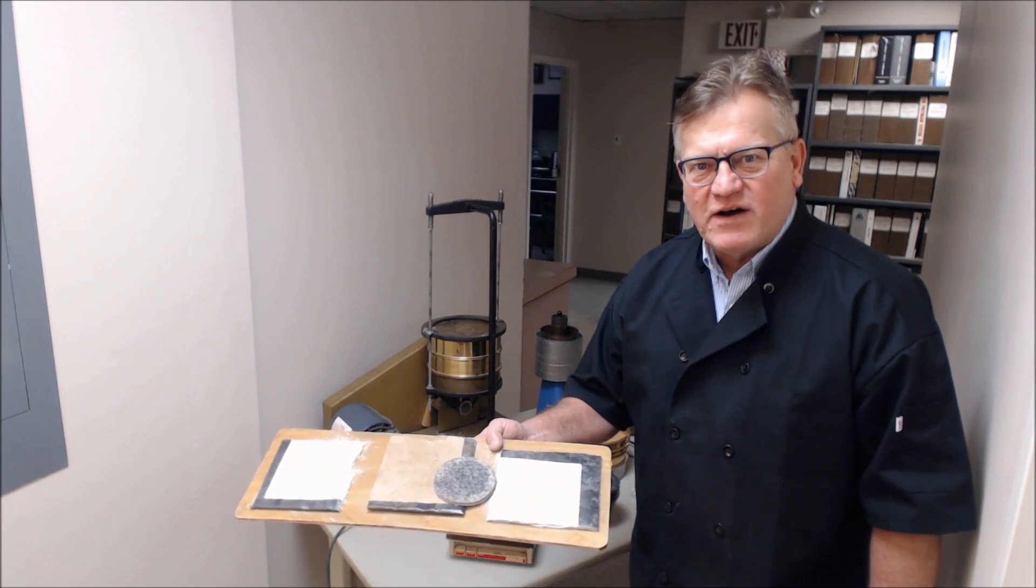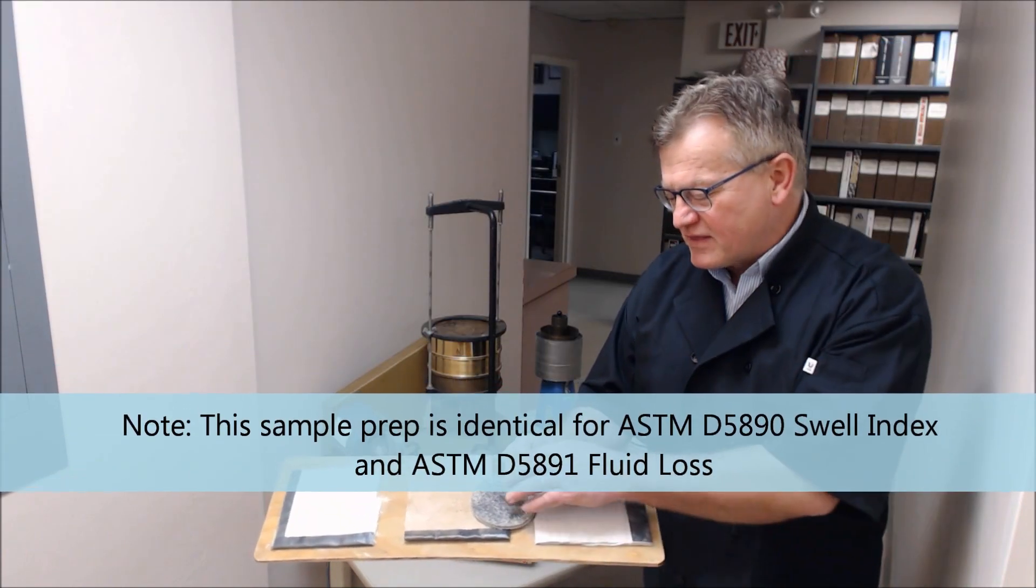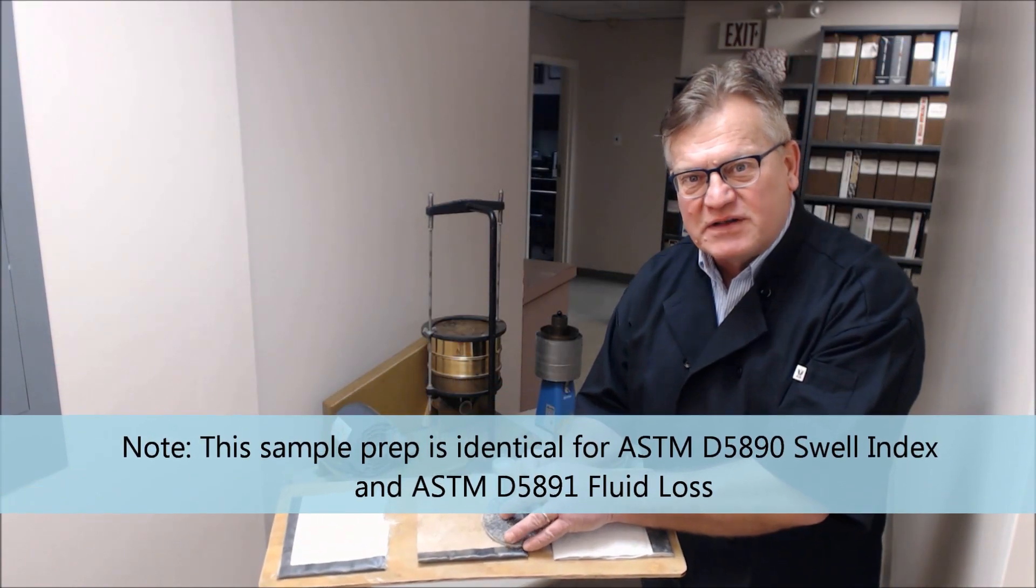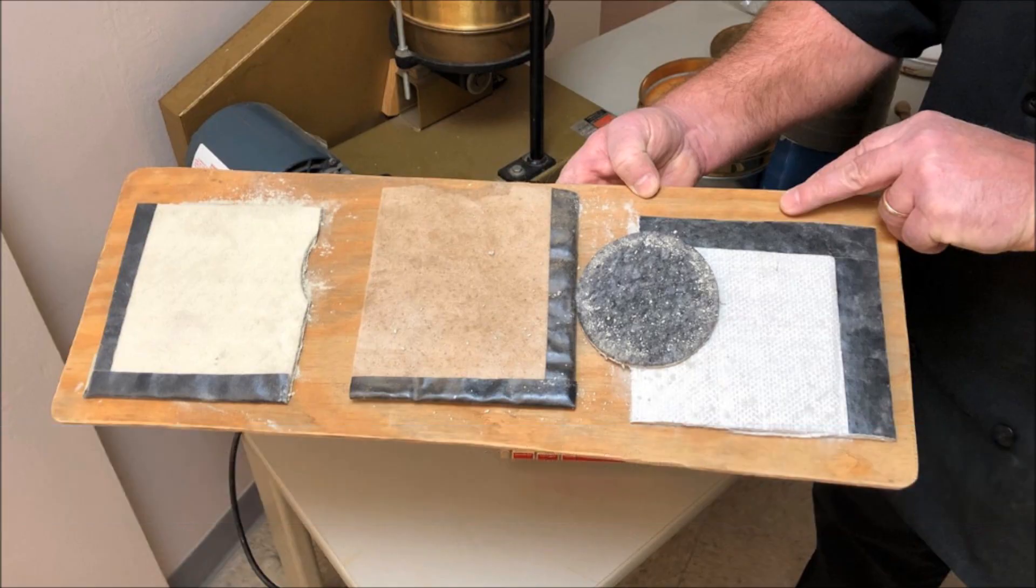Good morning, we're here at GSI to talk about GCL 3. The first thing we need to do is to get the clay in the infill of the geosynthetic clay liner. Here you see four different varieties.